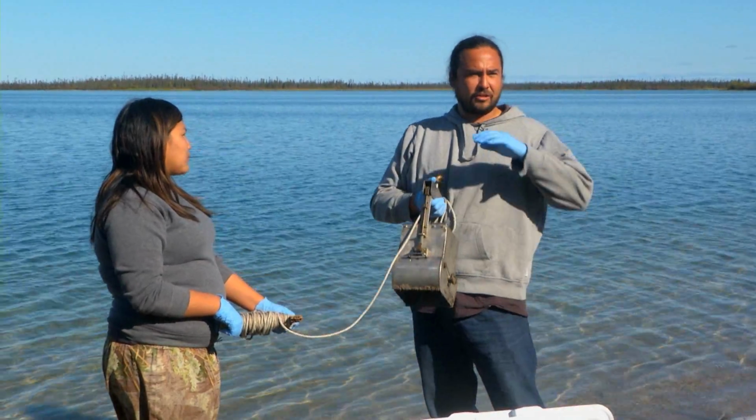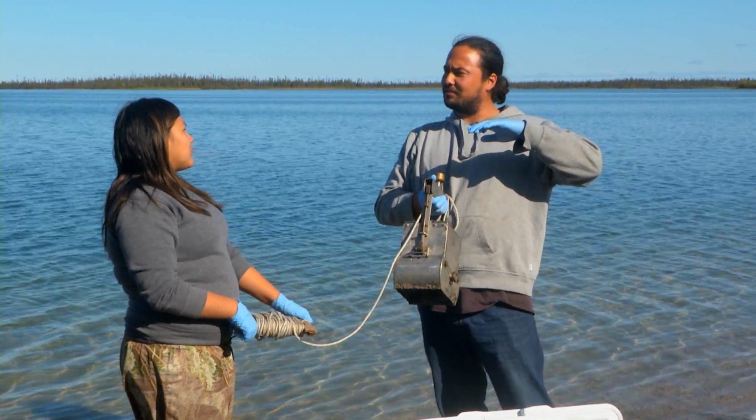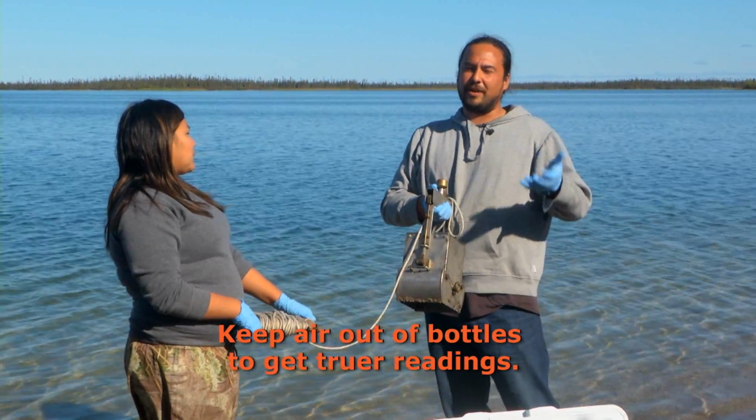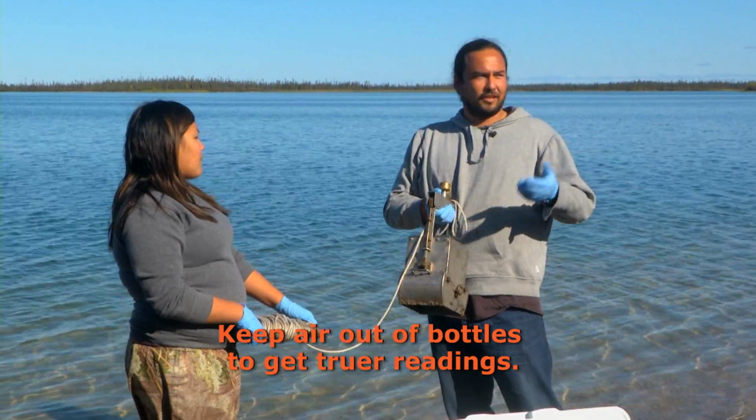You want to fill the jar to the top, and you want to get rid of as much air in there, because the more air that's in the sample, it'll slowly degrade your samples. It'll give you a false reading.